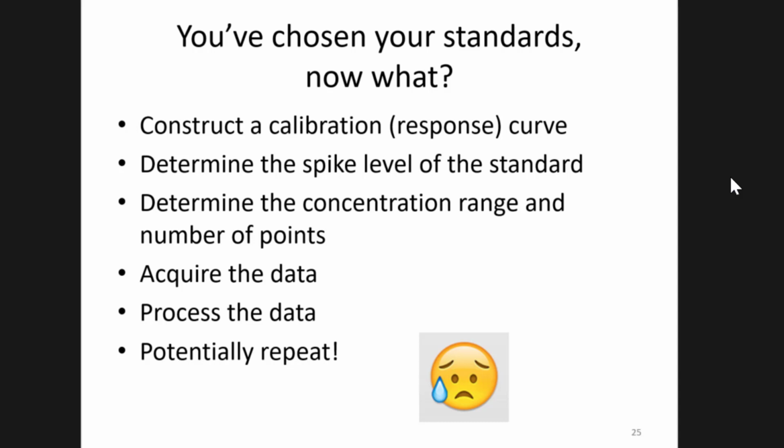So how about, when you talk about standards, heavy labeled or set of top labeled, could you actually synthesize your peptide and what is the percent efficiency of TMT label? You make it all the standard part of TMT. Yeah, people do that.